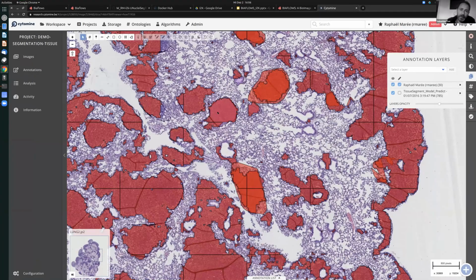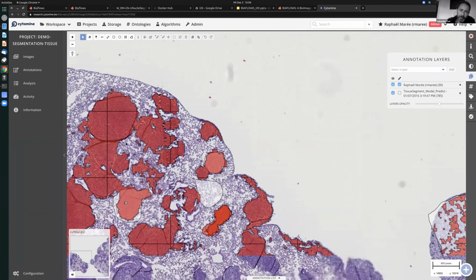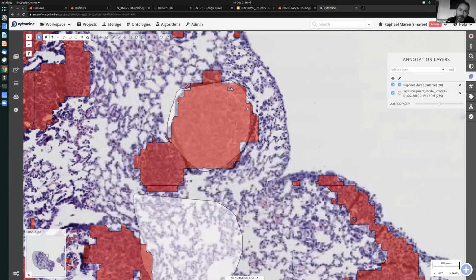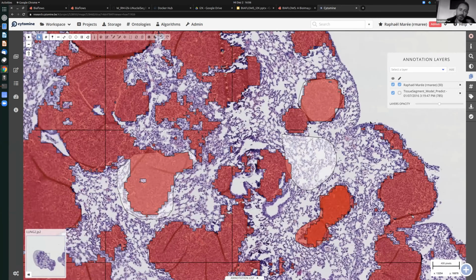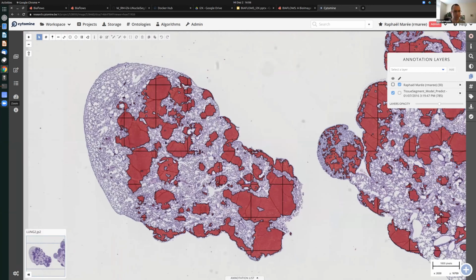On the roadmap, we would like to deal with other image formats, as you mentioned, large images, maybe have an automatic way to tile the images and process them by chunks, so that this could be completely automated at the level of the BIAFLOWS platform. And then again, dealing with different computing clusters and being able to allocate resources from these clusters within BIAFLOWS as well. But it's not there yet. We were coming from benchmarking, and that was not in the initial picture, let's say. Okay. Makes sense.